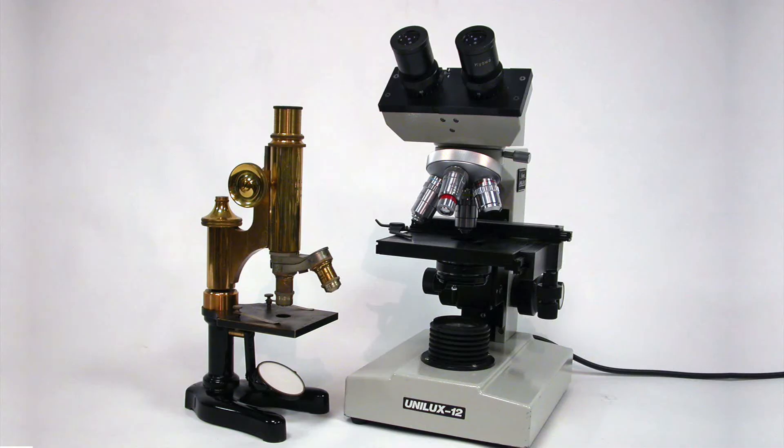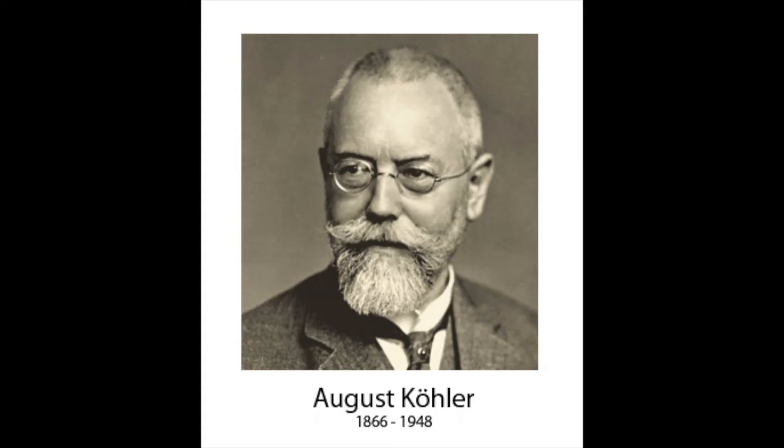I've introduced you to the different components of the microscope, and now I want to show you how to set them up so that they work together to give you the best possible image of the subject on your slide. This method results in your microscope providing what's called Kohler illumination, after Mr. August Kohler who first perfected the method in the 1890s.